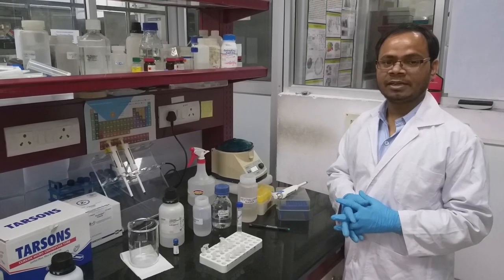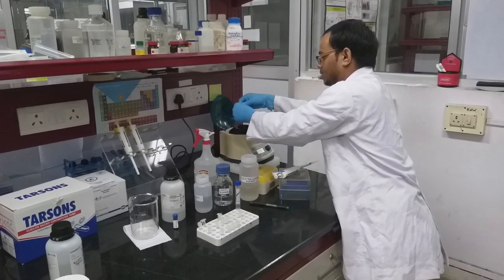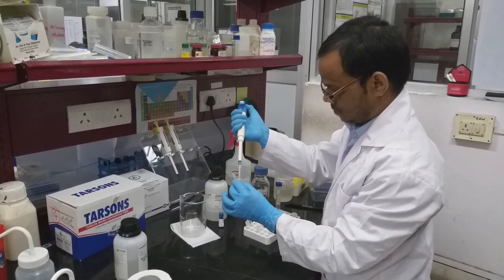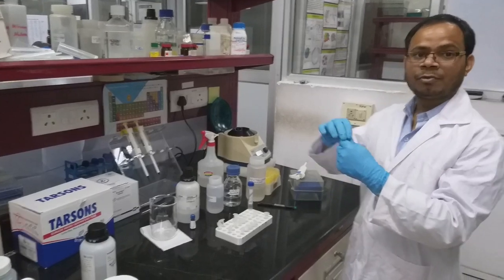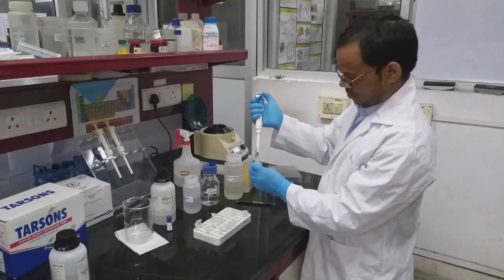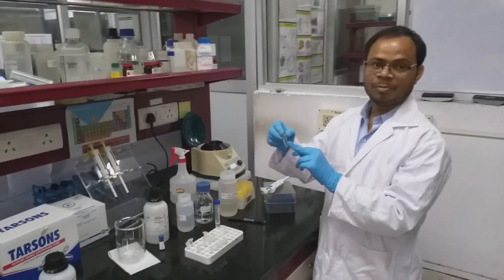After precipitating plasmid DNA with the isopropanol, we will get a pellet of plasmid DNA. Now we have to wash that pellet. We wash this pellet with the 70% ethanol. Again, centrifuge the pellet.